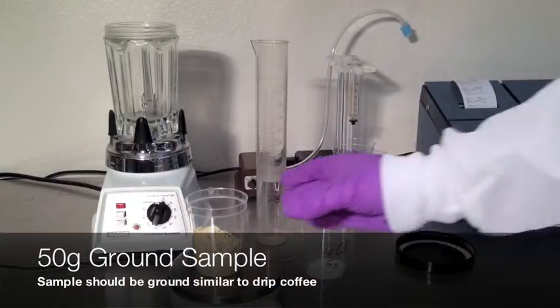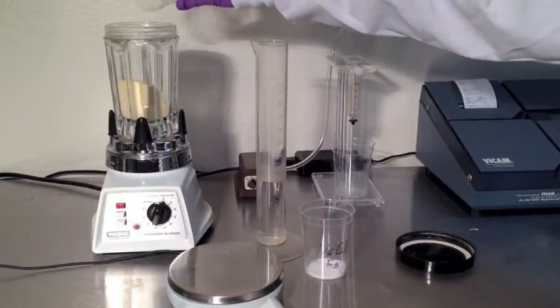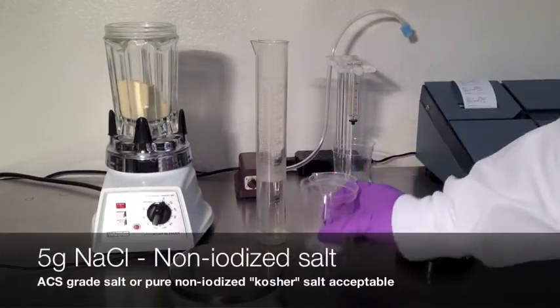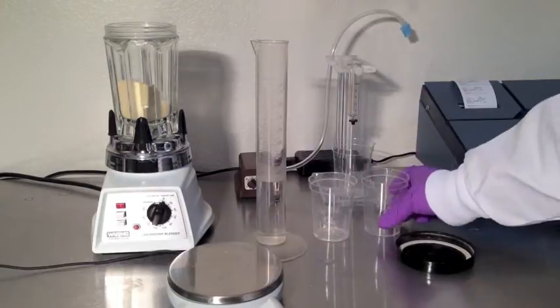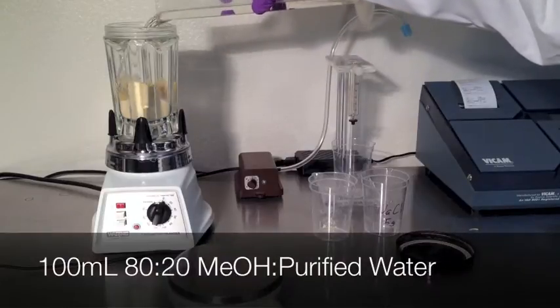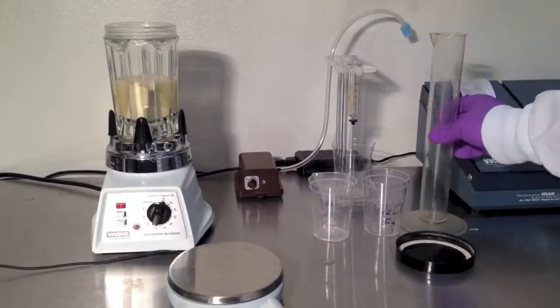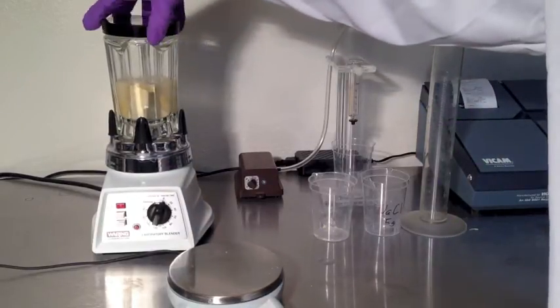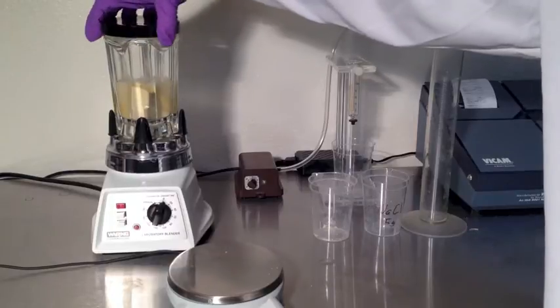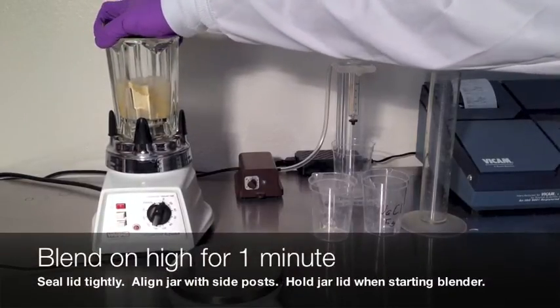Combine in the lab blender 50 grams of ground sample, 5 grams of non-iodized salt — kosher salt is acceptable for this — and 100 milliliters of 80-20 methanol. Tighten the lid carefully and align the jar with the posts on the blender motor base. Blend on high for 60 seconds.